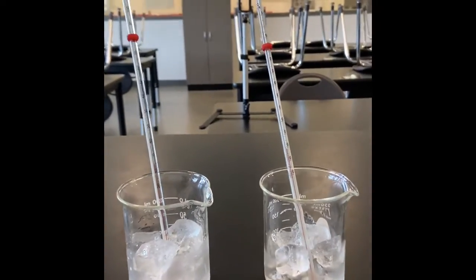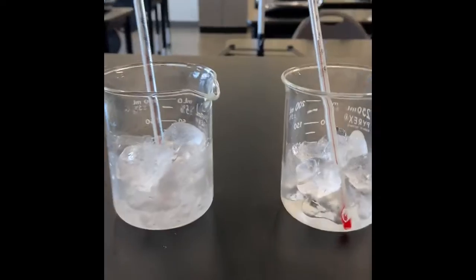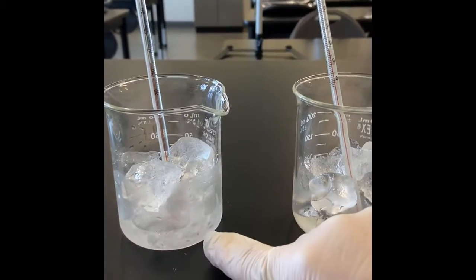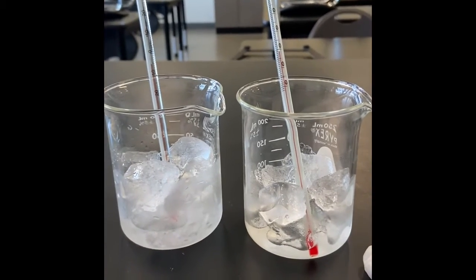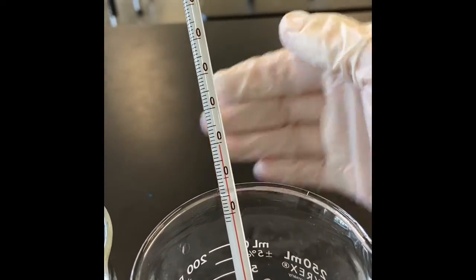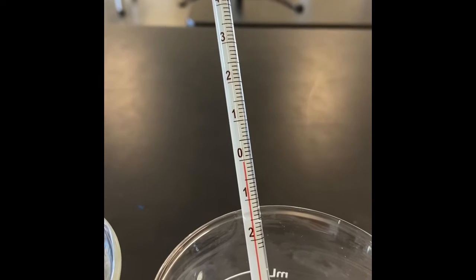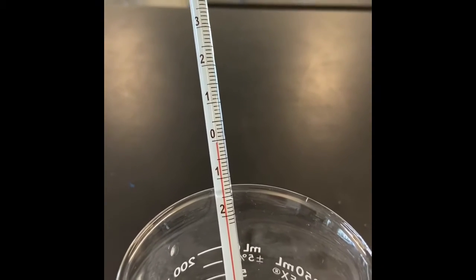All right, it's been about 2 or 3 minutes just to let our thermometer change. And already I'm making some observations. I can see that the mixture of salt and ice or salt and water is a bit cloudier looking. There appears to be a bit more water as opposed to this beaker that just has ice and water in it. But let's look at the temperatures. Here, it looks like the temperature is just between, let me turn it, 0 and -1 degree. A second ago is between 0 and 1, so it's hovering right around 0. It hasn't changed a whole lot.